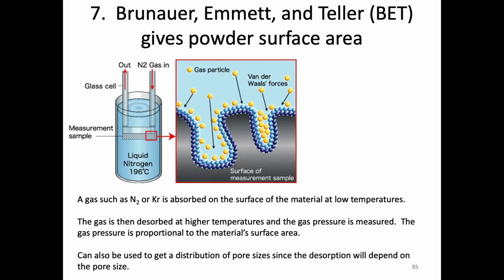Okay, so now let's move on to some other techniques in measuring different than particle size. So the first one is BET. This is 3 scientists' names, basically, but shortened to just be BET. So what this does is, as opposed to all the techniques we've talked about so far, this doesn't necessarily give us particle size. What it actually does is give us surface area. And so obviously surface area will tell us something about the size of the particles, but if we have a lot of pores and irregularities the surface area can be quite large compared to a very smooth particle.